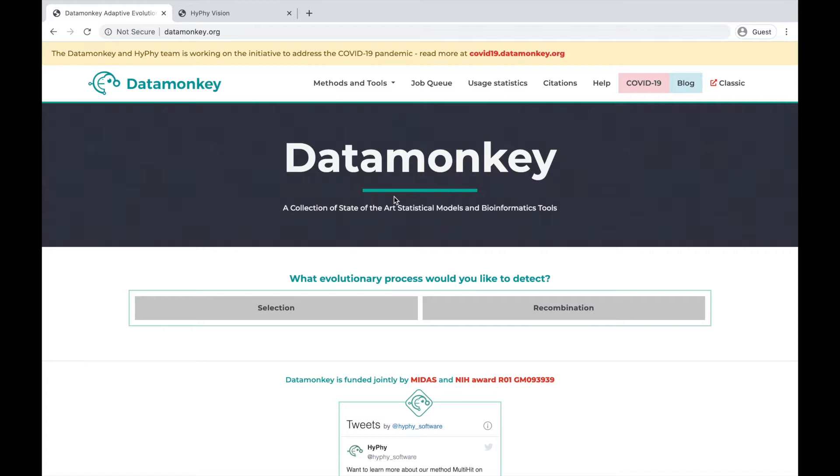Datamonkey.org hosts a variety of statistical methods and tools to help you analyze your genomic data. We mainly focus on detecting selection and recombination.